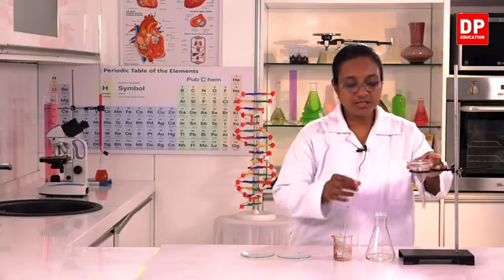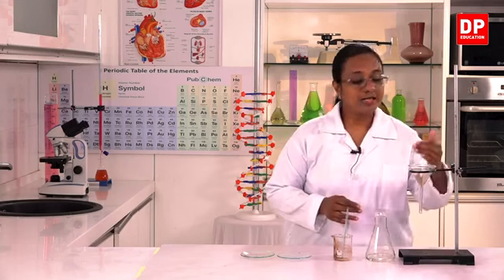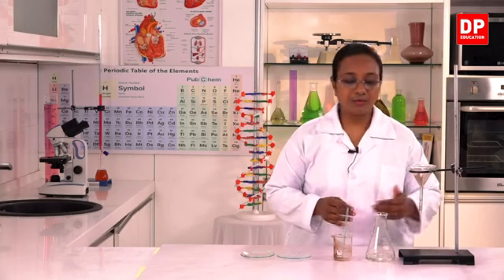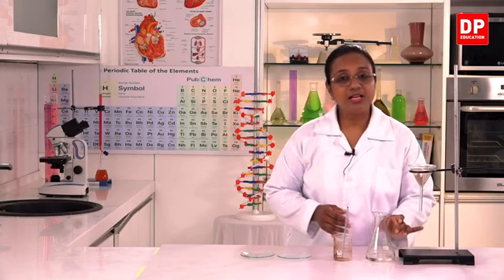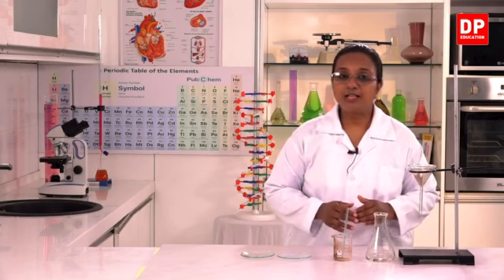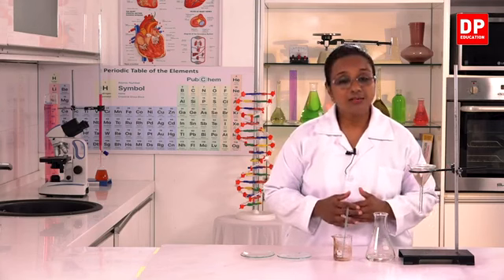And the solution containing the solute with smaller particles that can be filtered through the filter paper enters into the flask, and that is the filtrate. So this is the method of filtration where we have separated the components of a mixture.